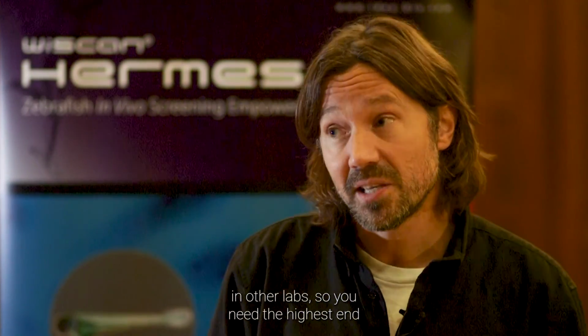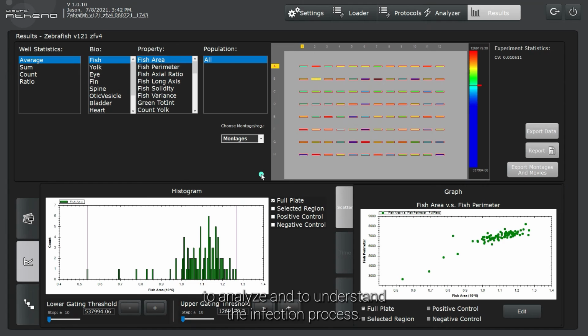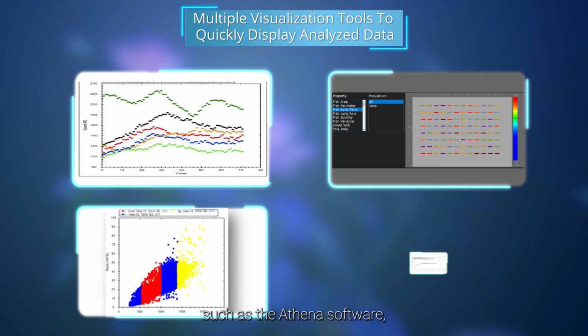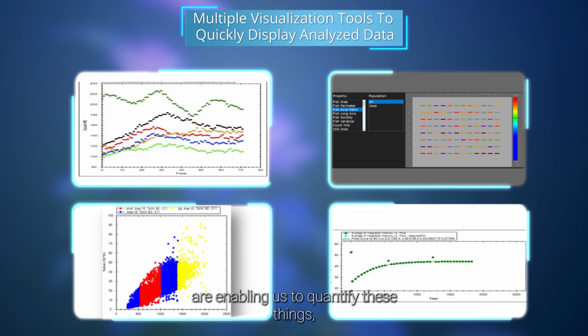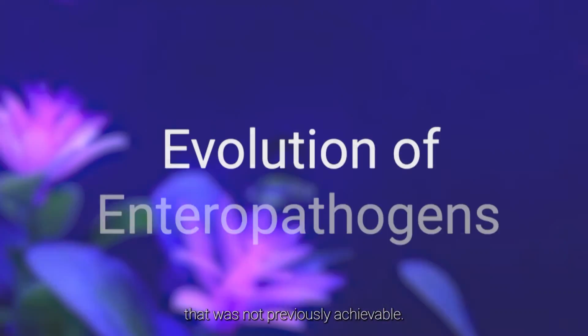And so you need the highest end resolution microscopes, but you also need better tools to analyze and to understand the infection process. But it is an exciting time because tools such as the Athena software are enabling us to quantify these things, I guess, at a pace and at a resolution that was not previously achievable.